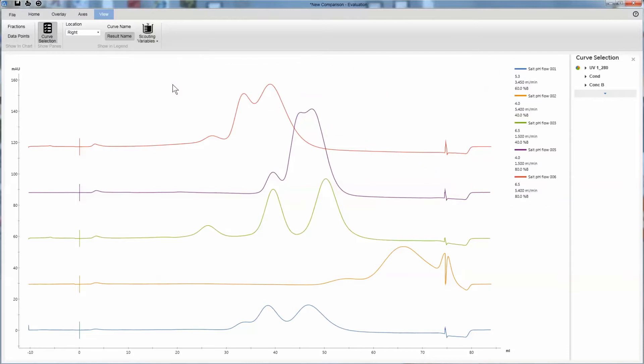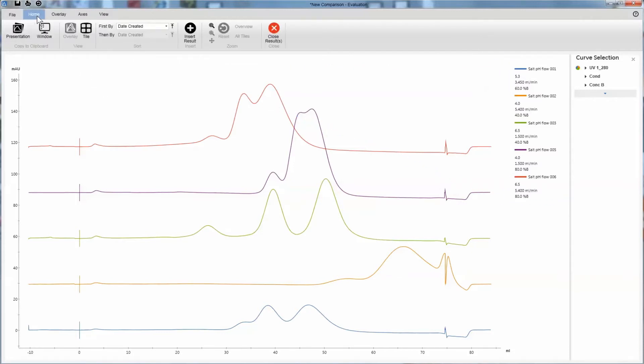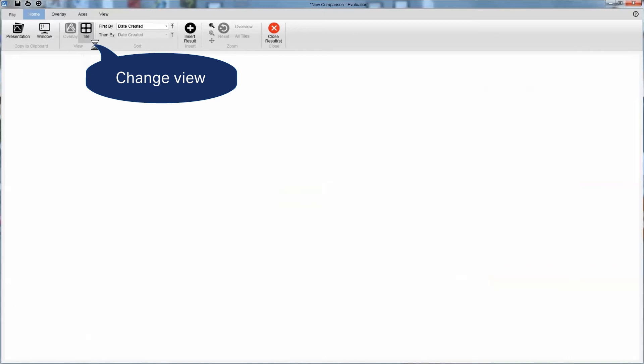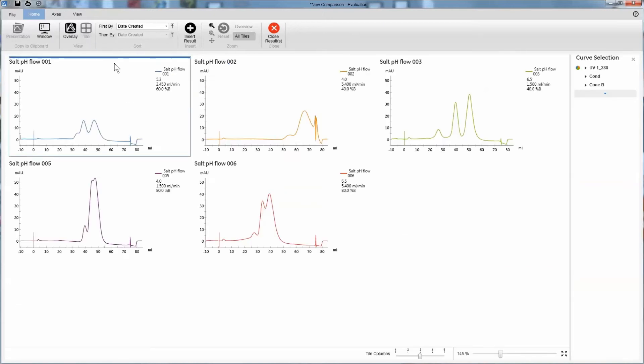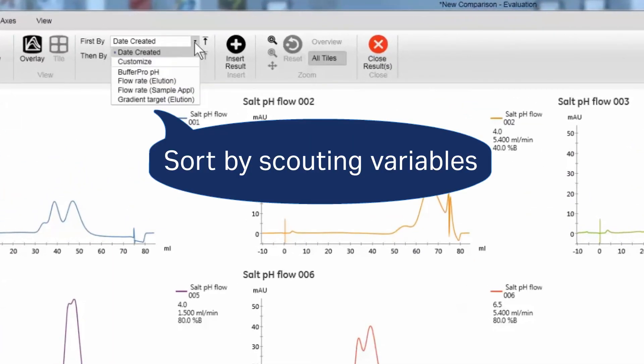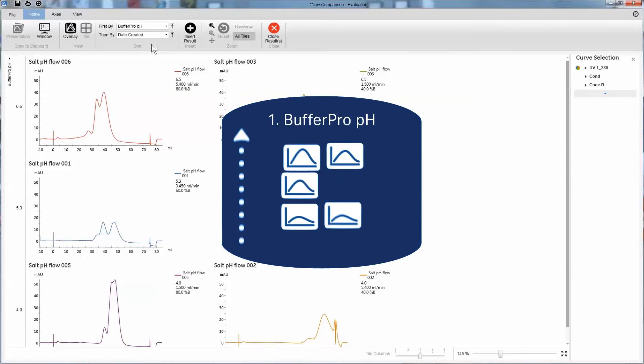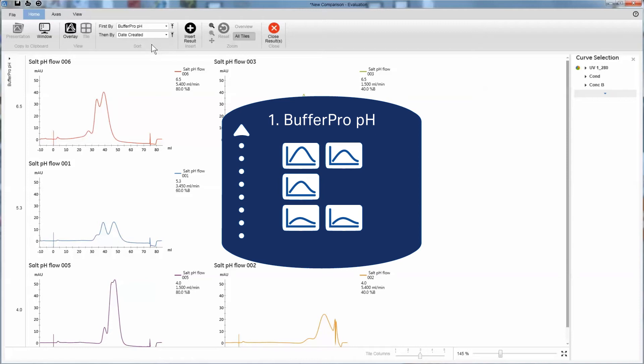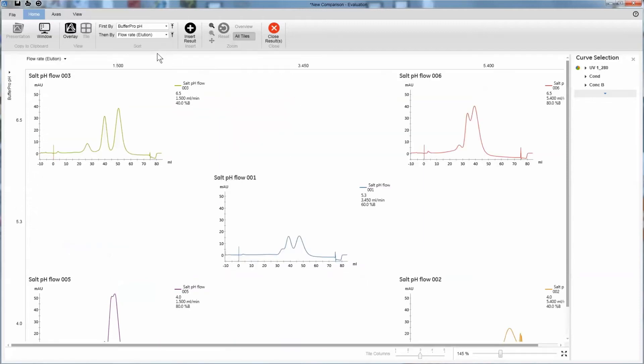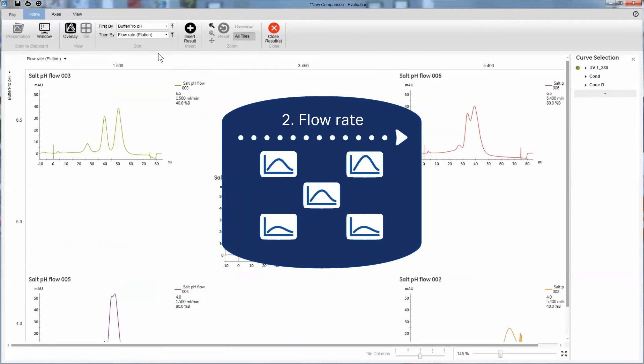See how your different settings affect the elution patterns by switching to Tile View. You can then sort the charts by different scouting variables. This gives a great overview of how the variables affect your run.